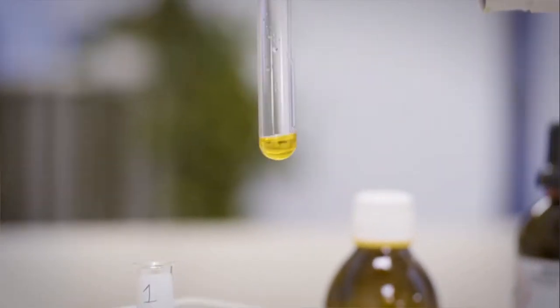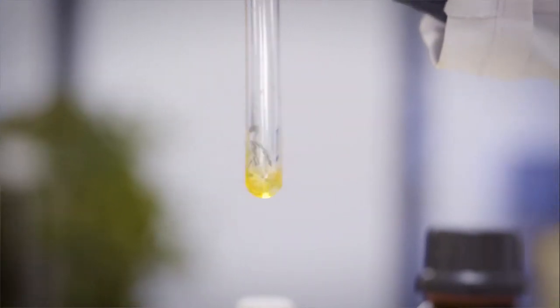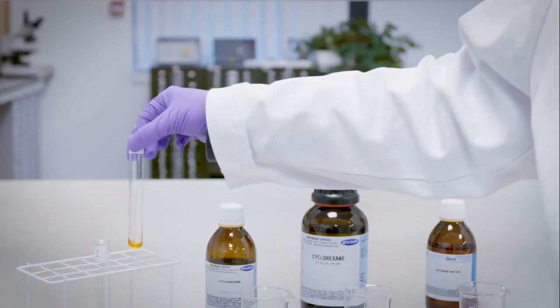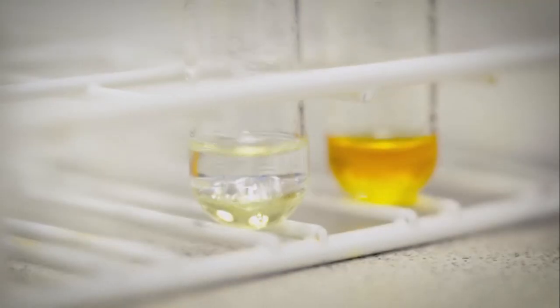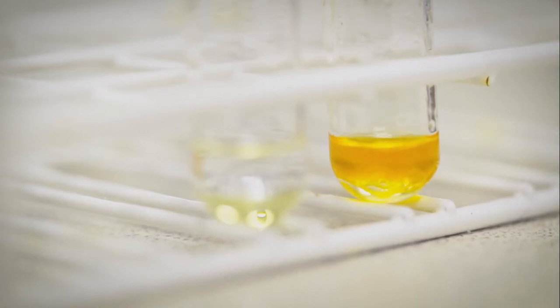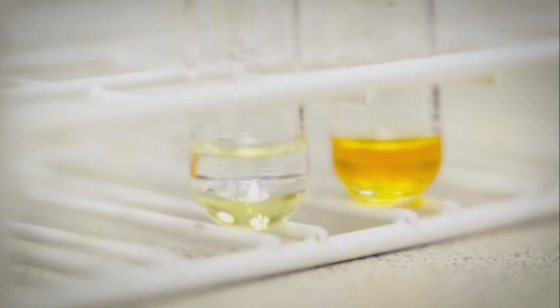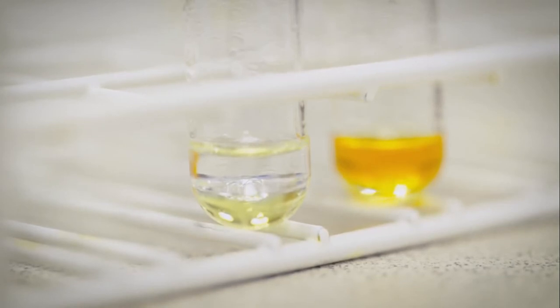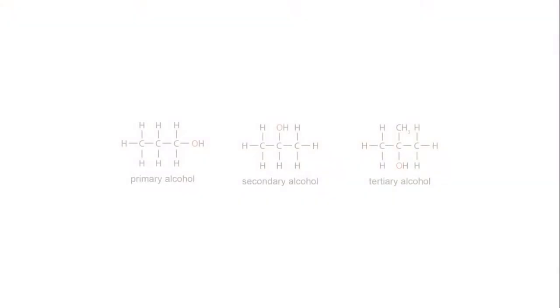Test tube 2, containing cyclohexane, is also shaken. After shaking, the yellow-brown colour in the aqueous phase transfers to the organic phase because bromine is more soluble in the organic phase. However, it is not decolourised, confirming that there are no double or triple bonds present in the molecule.